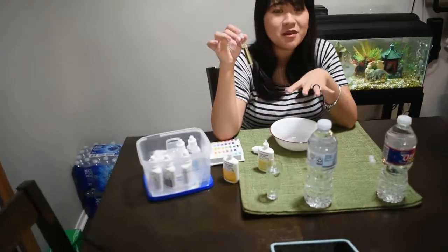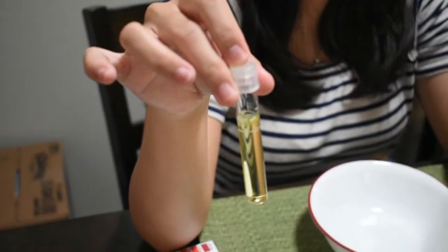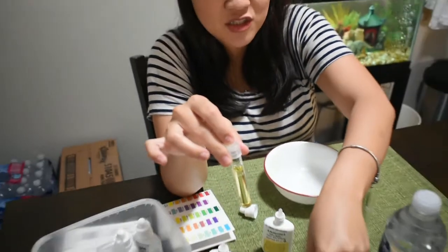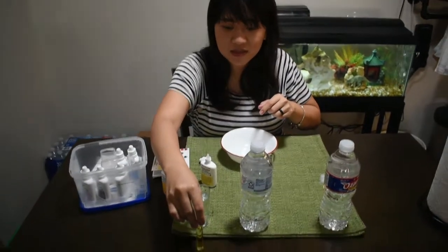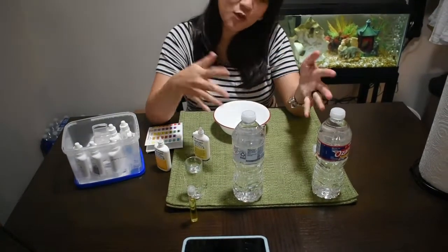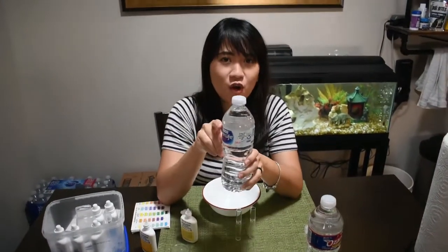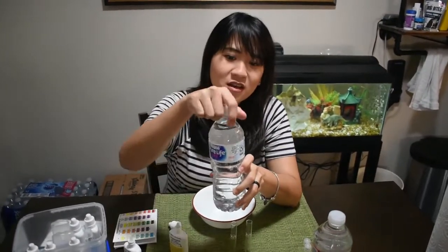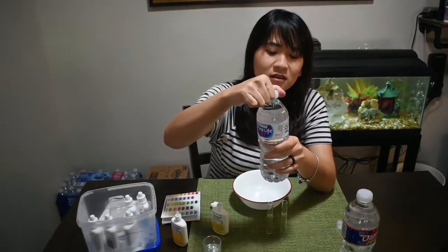And we wait at least 5 minutes, but sometimes it gives you result really quick, like 2 or 3, but it's around 5ish. So I will put this, this is the tap water, in front of the tap water bottle, and we will go next while we wait. And just so you know, this is still sealed, so I don't put something inside it or something like that.